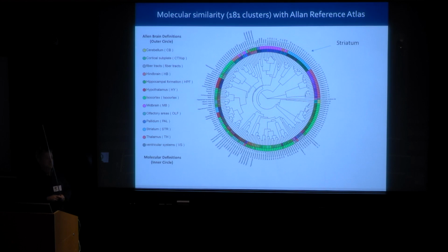Yeah, I don't really follow what you mean. Sometimes you see some expression pattern that kind of crosses from the cortex to, like, hippocampus, some RNAs kind of expressing, not necessarily strictly bounded by region.